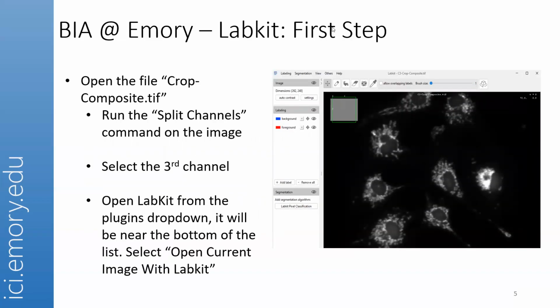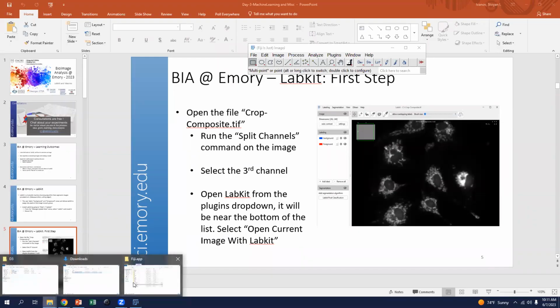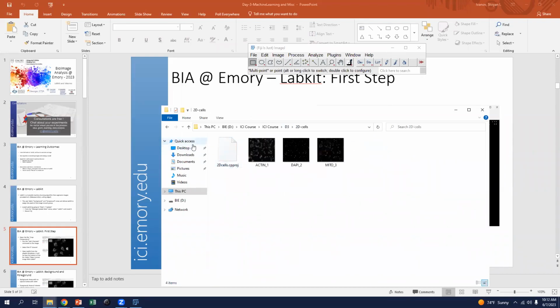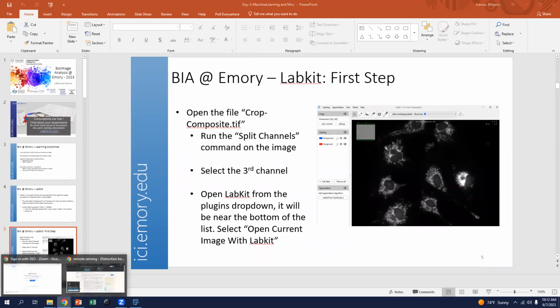So let's go ahead and get started. Go ahead and open the crop composite image. I don't have the right one downloaded. One second.